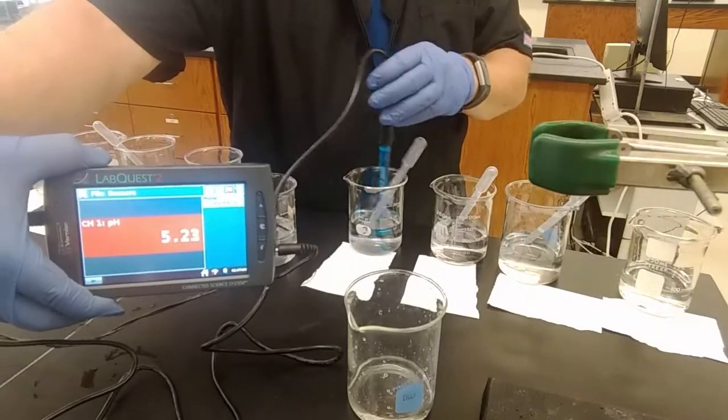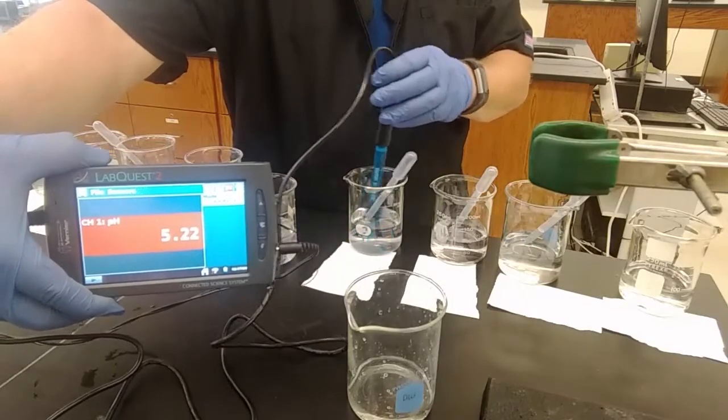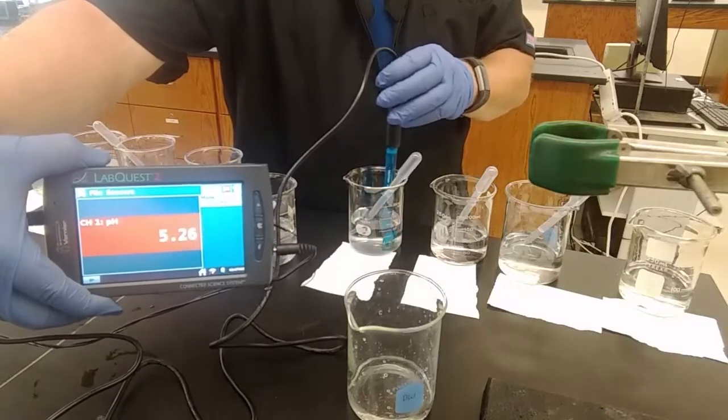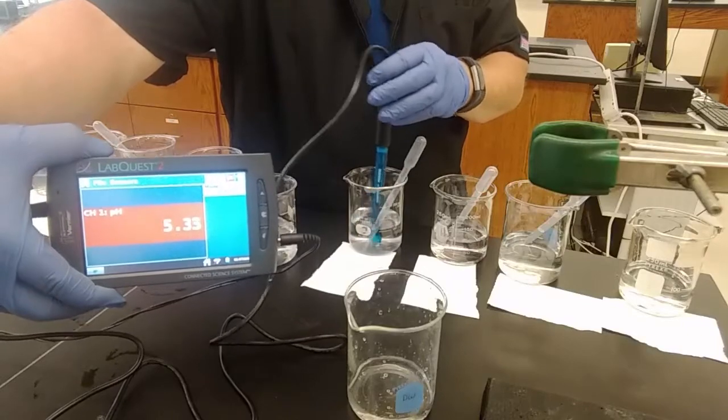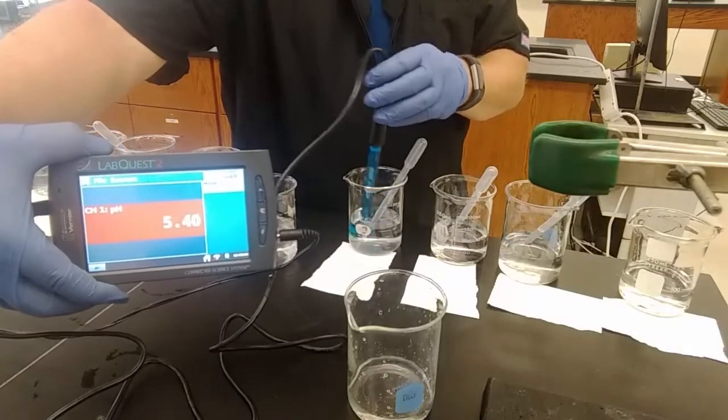This lab doesn't work particularly well, which is a nice lesson and why I'm considering leaving it in the manual. And then also it doesn't work very well, which is why I'm considering taking it out of the manual and measuring pH of things around your house, like oven cleaner and window cleaner and things like that.